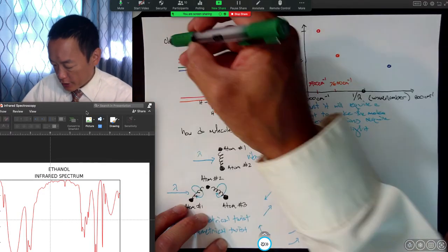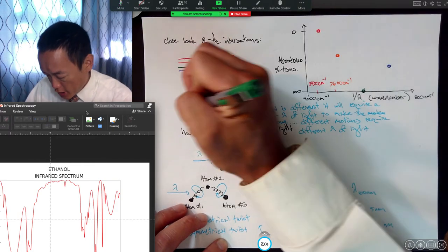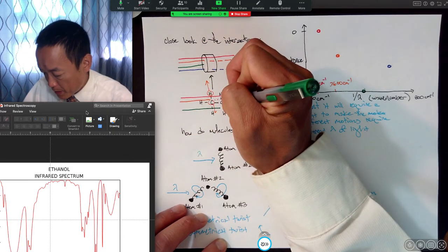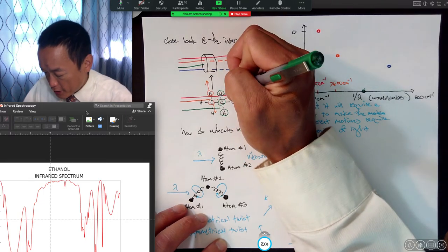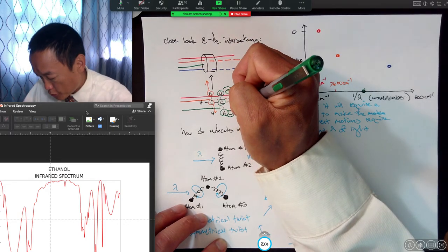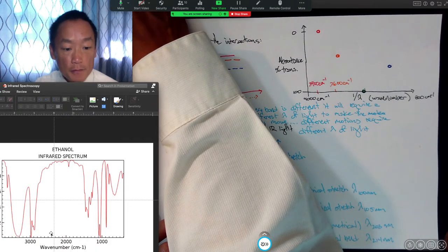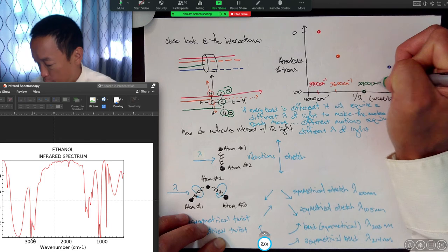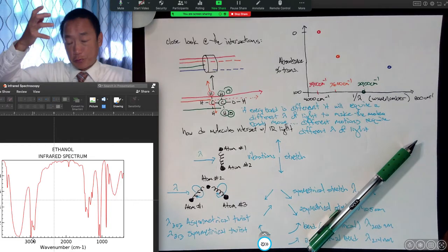Maybe we're looking then at this green section, and all of a sudden that green section comes flying through here, and we end up getting a massive response by this molecule. And this carbon and this hydrogens, maybe this is causing it to corkscrew this way, and this energy causes this portion to corkscrew this way, and we end up with a point where we see an immense amount of absorbance. So maybe we'll say 2,900 inverse centimeters right here. All of that energy was absorbed by the sample and caused those atoms to twist with respect to one another.